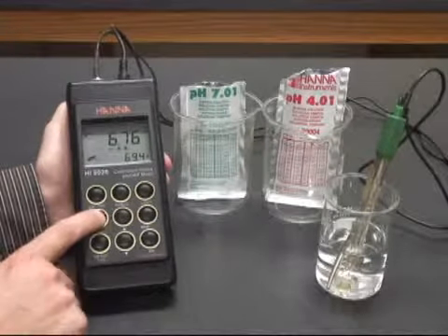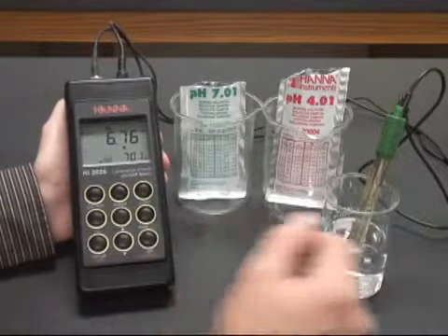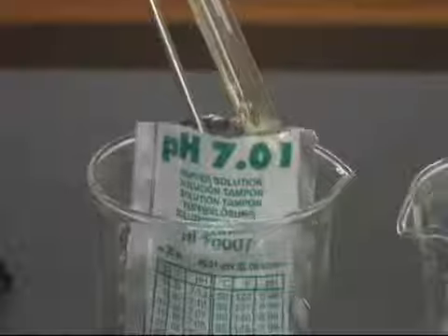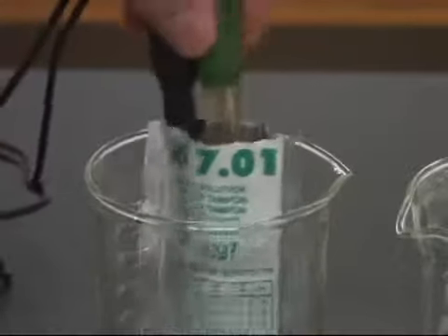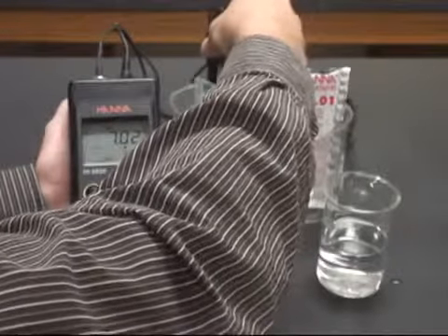What we're then going to do is push the Cal button and move into the calibration mode. You'll see it ask us for 7.01 buffer. We put the temperature sensor and the pH electrode into the 7 buffer, mix it around a little bit to make sure that we're getting any air pockets out of there.